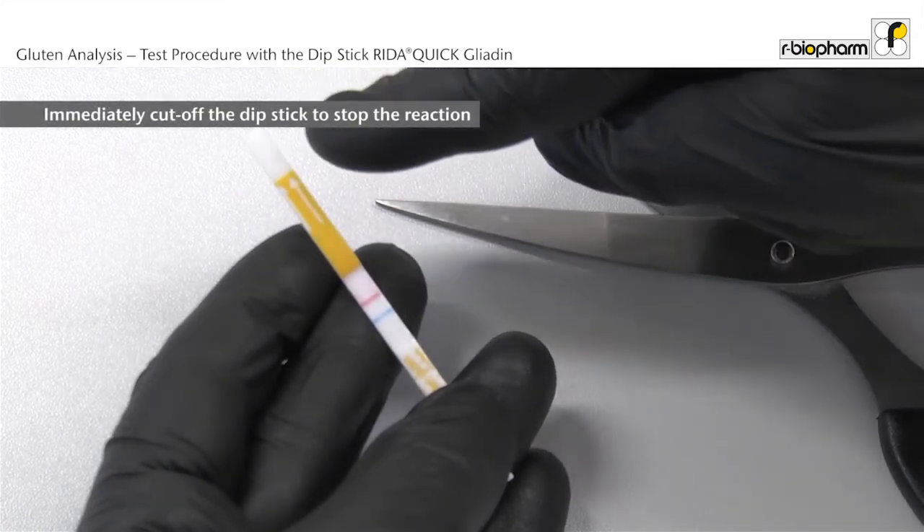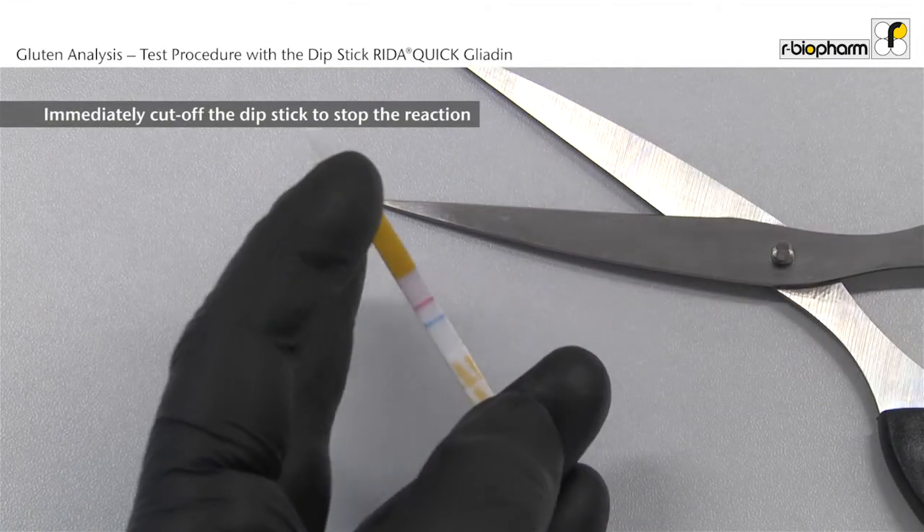For documentation, cut off the upper part of the dipstick marked with gluten together with the test bands.